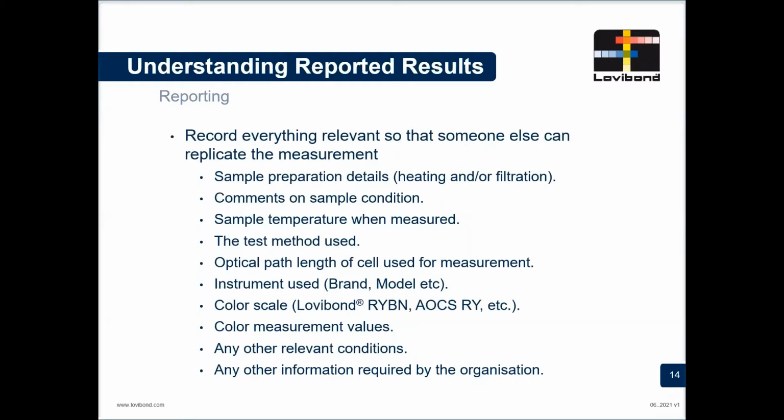And then most importantly, we need to say what path length we're using. Most of the standards will assume that if you don't record a path length, it's a 5 1/4 inch cell. But that might not be the case for what you actually use. You may have used something like a 50mm or a 10mm or 1mm even, or 1 inch path length cell. So you need to make sure that you put the path length in.